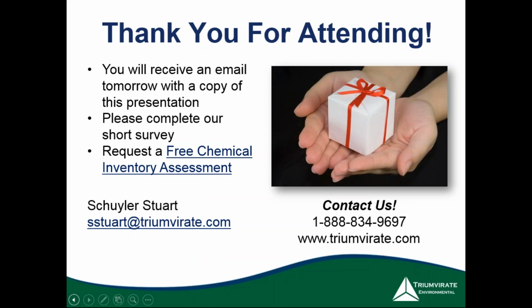Our final question is, what fields do you recommend putting in the chemical inventory? For example, trade name, chemical name, supplier, etc. So yeah, you definitely want to have your chemical name, quantity, and hazard associated with it. If it's a flammable material, you want to get as much information as possible, like what flammable class it is, and some inventories are better at it.